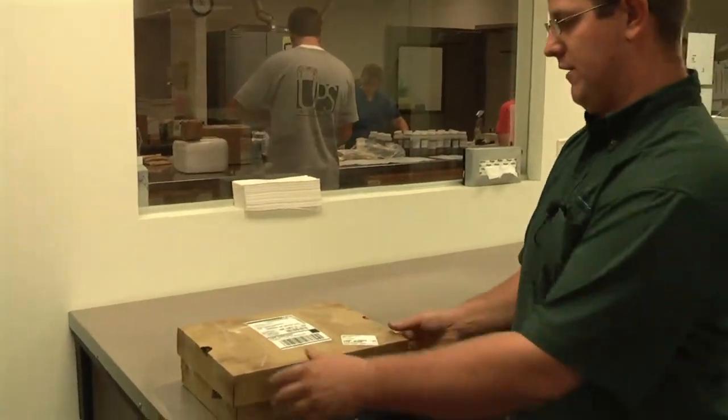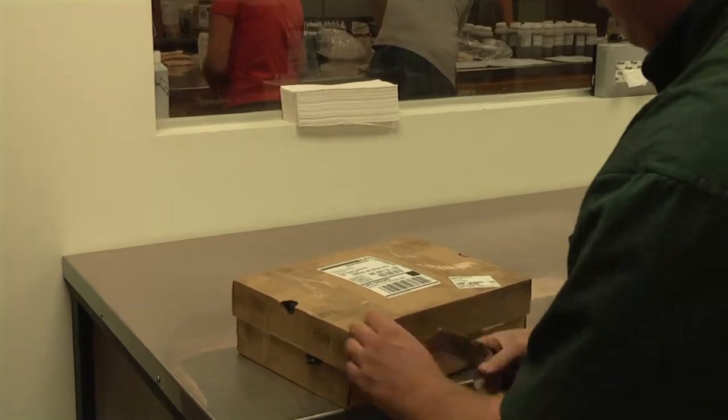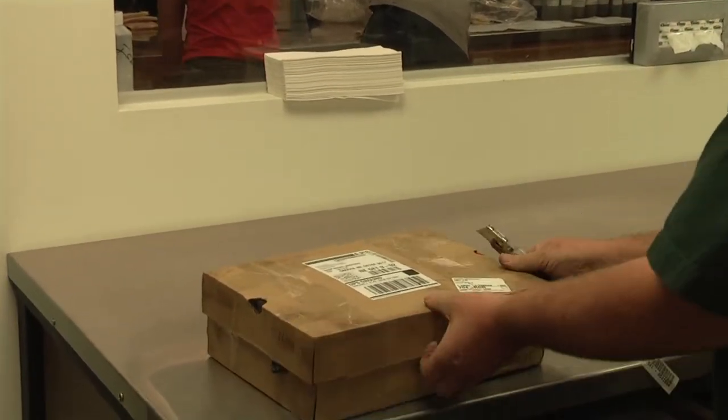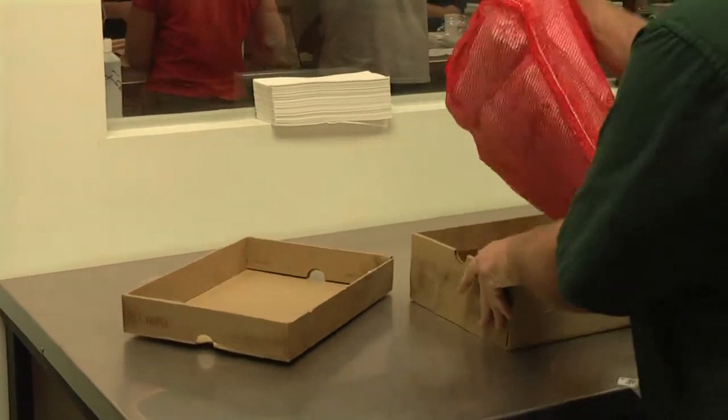We are now in one of the areas of receiving for sample prep. This is one of the boxes that we received off of UPS today. What we're going to do is open it up and take the samples out.